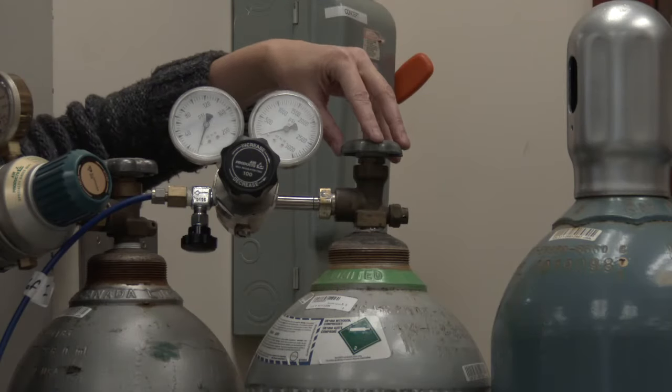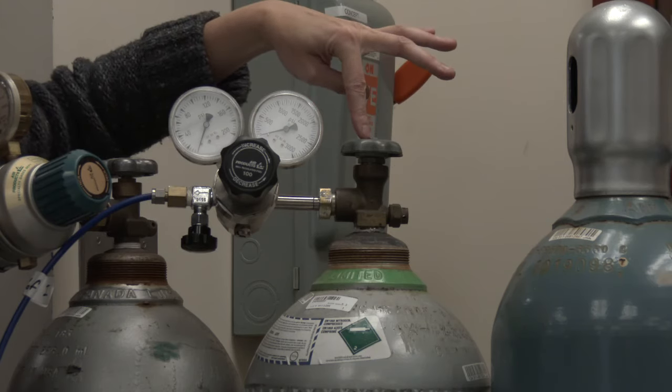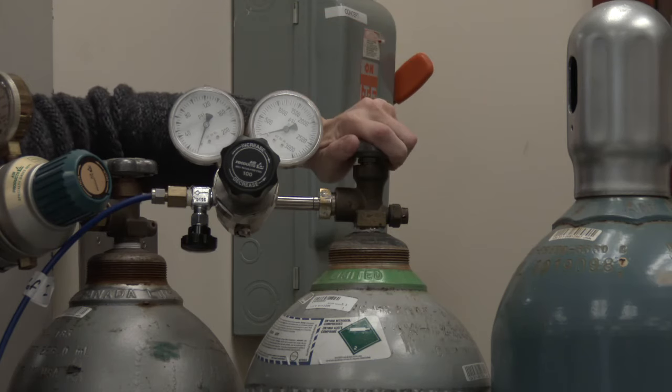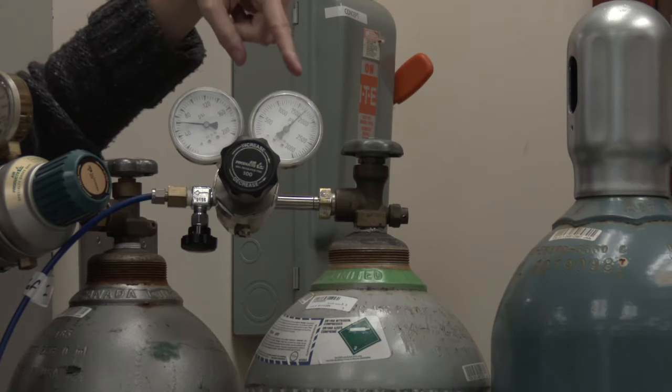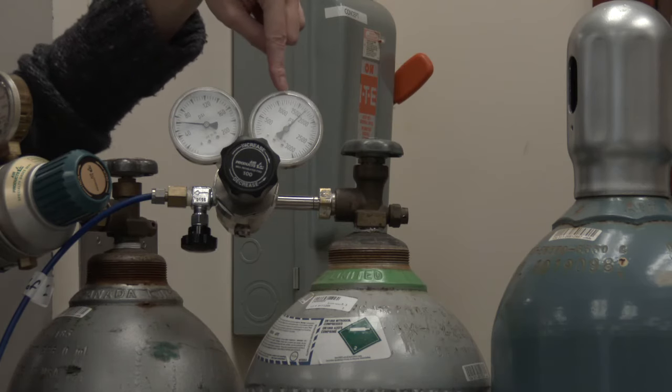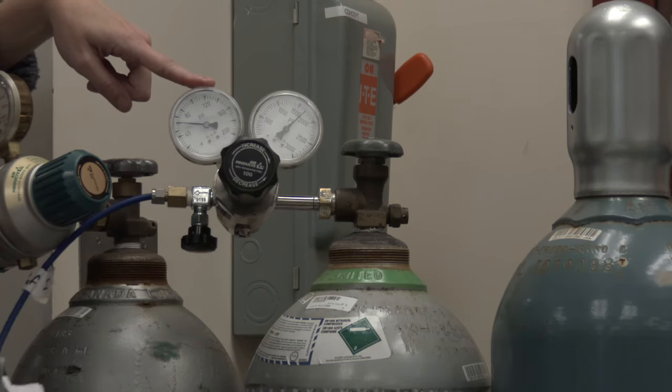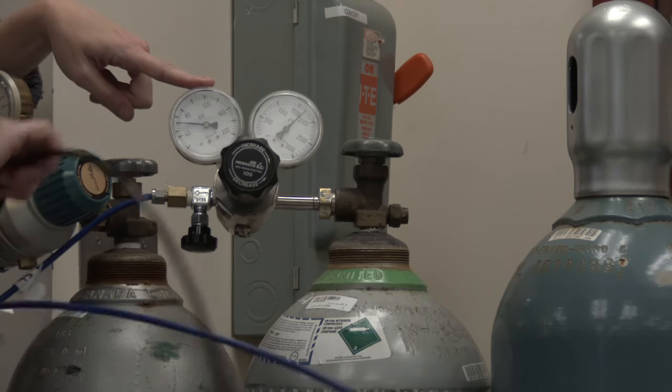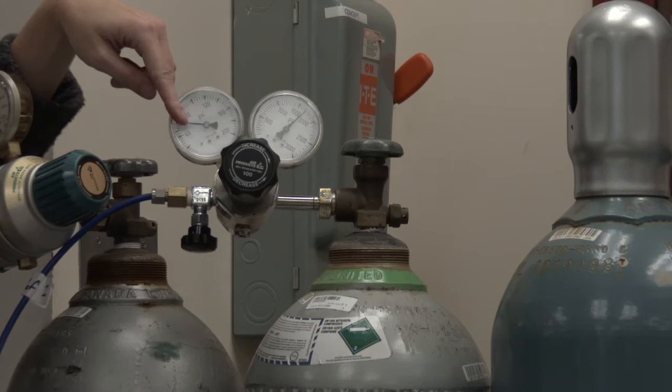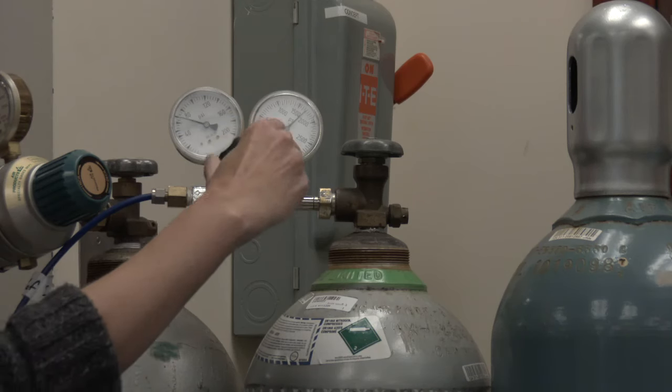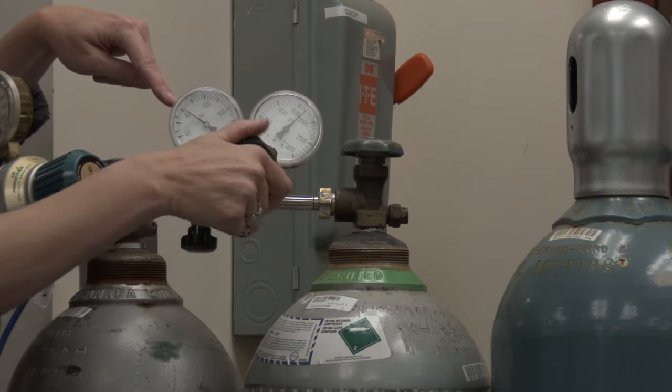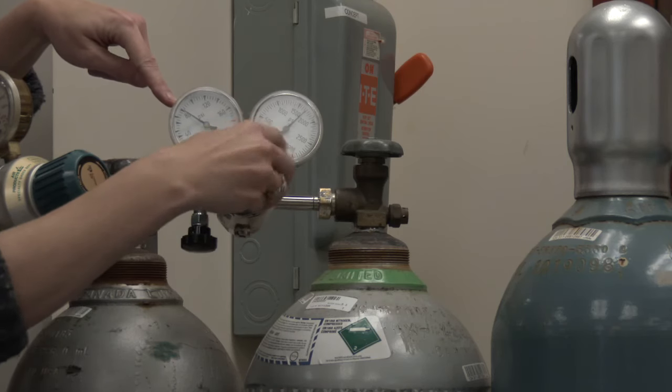A regulator attached to the gas cylinder allows you to monitor the pressure inside the cylinder and also regulate the pressure of gas leaving the cylinder. This gauge measures how much pressure of gas remains in the cylinder and consequently tells you how full or empty the cylinder is. This gauge measures the pressure of the gas leaving the cylinder. For most electrospray instruments, that's normally about 70 psi. Tubing able to withstand high pressures takes the gas to the instrument. The knob in the center of the gauges adjusts to regulate the pressure of the gas leaving the cylinder. Clockwise increases the pressure.